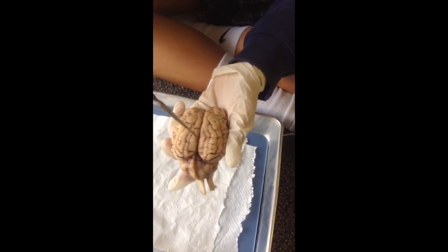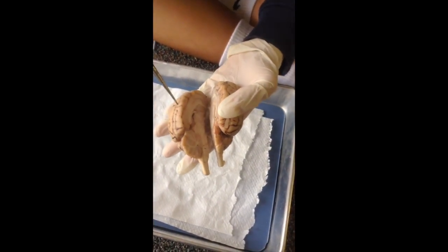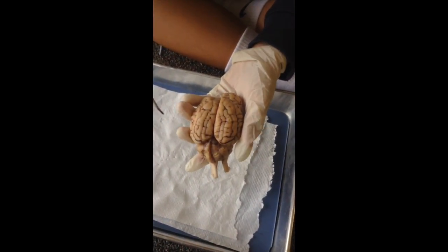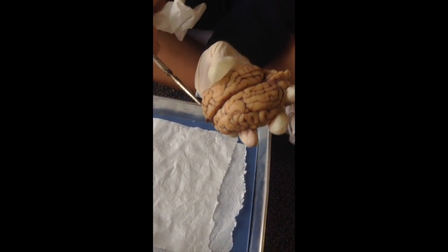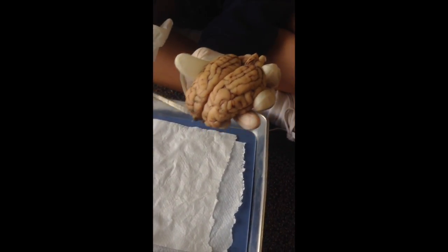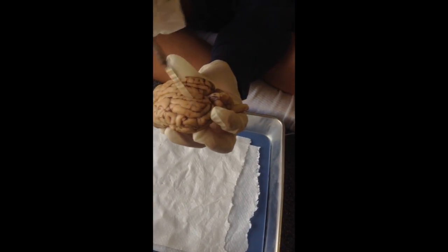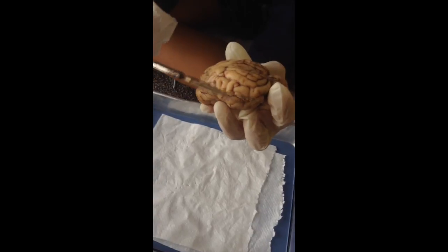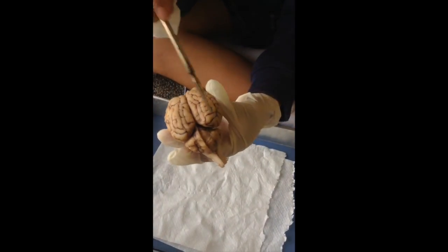Longitudinal fissure is a groove that separates the two hemispheres. The meninges are 3 connective tissues that cover the entire brain. The frontal part is where voluntary motor function and muscle movement occur. The parietal is where sensory reception happens. The temporal controls hearing and memory. The occipital controls vision.